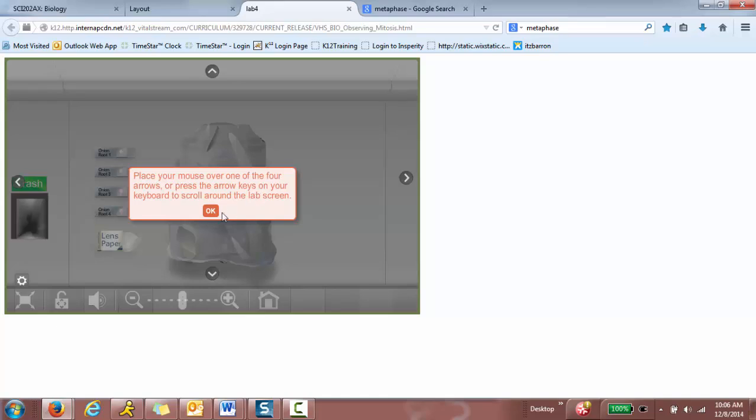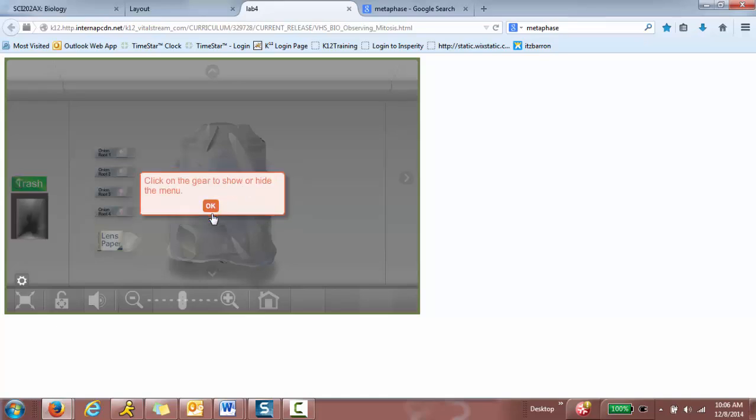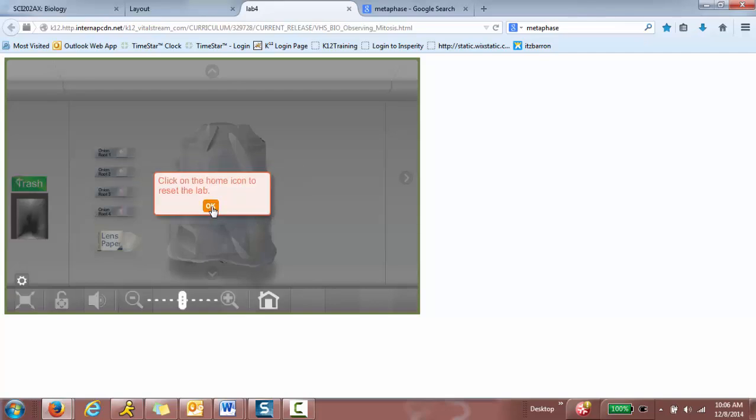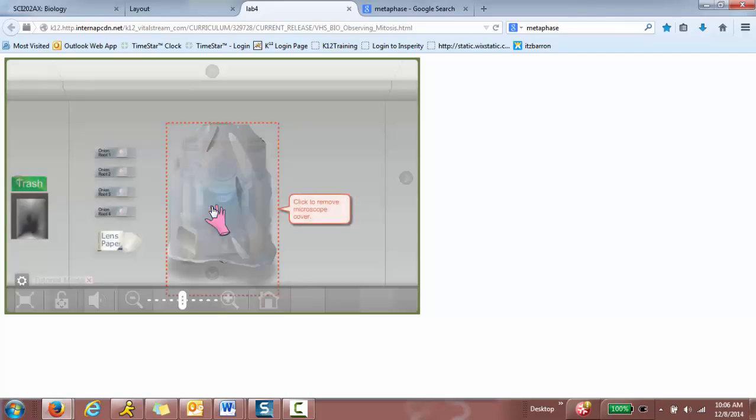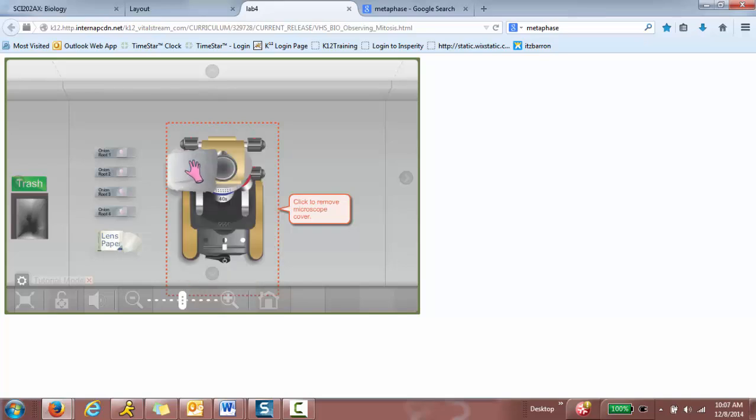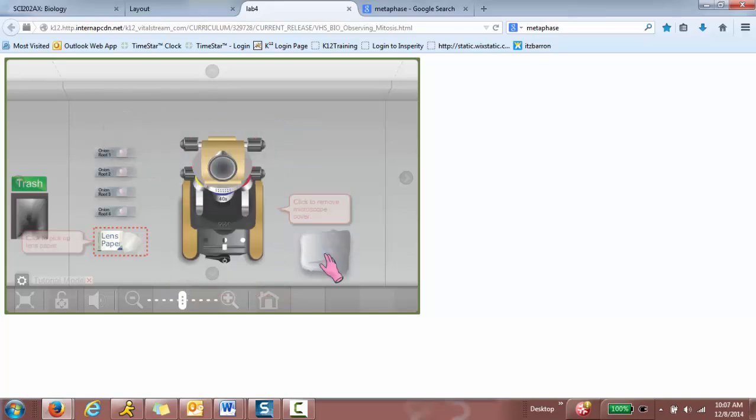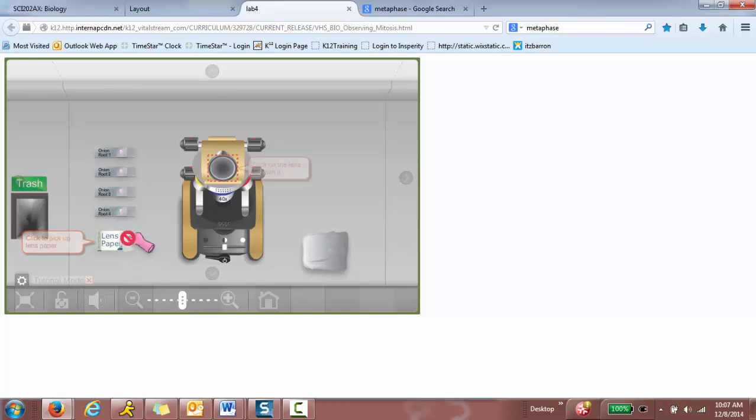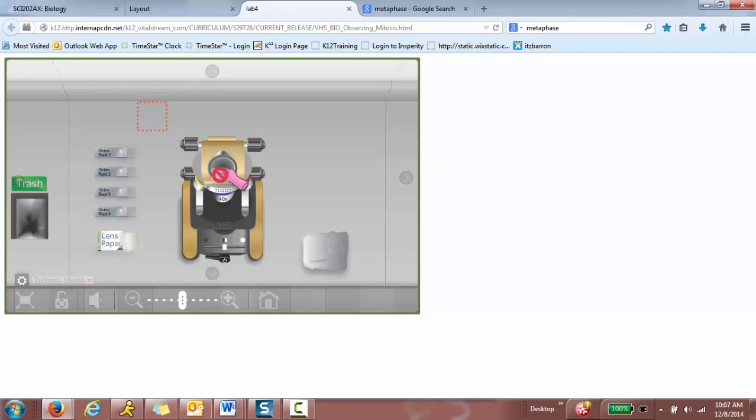Anyways, let's go ahead and click start and then you're going to go through the tutorial and click to remove microscope cover. So you take the microscope cover off. Click to pick up lens paper. Click on the lens to clean it. Then you clean it. I just click and hold and then wipe it.